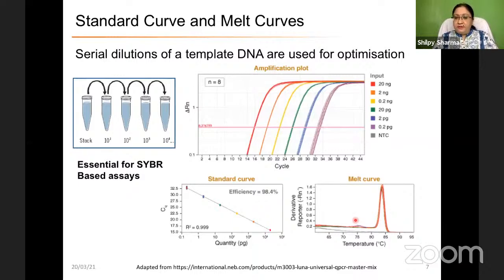So what you can do is a melt curve analysis. When you do a melt curve analysis, you increase the temperature after the reaction is completed, after the number of cycles are done. The double-stranded DNA that you have, you will keep increasing the temperature by 1 degree, and you will see how the SYBR Green fluorescence will decline.